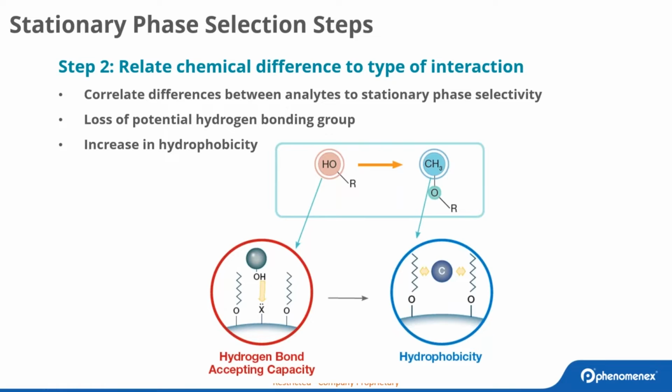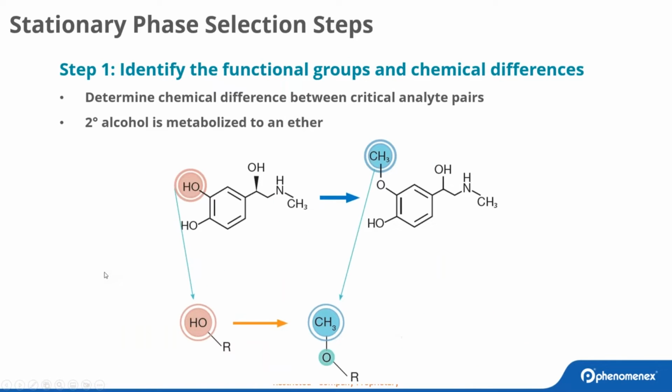So when you look at these different stationary phases, right, I skipped ahead, I think. There we go, step one. It's important to start at the right step, right? So here are a few of the different selection steps that you can take to pick a good phase to start with, right? And that will impact your selectivity.